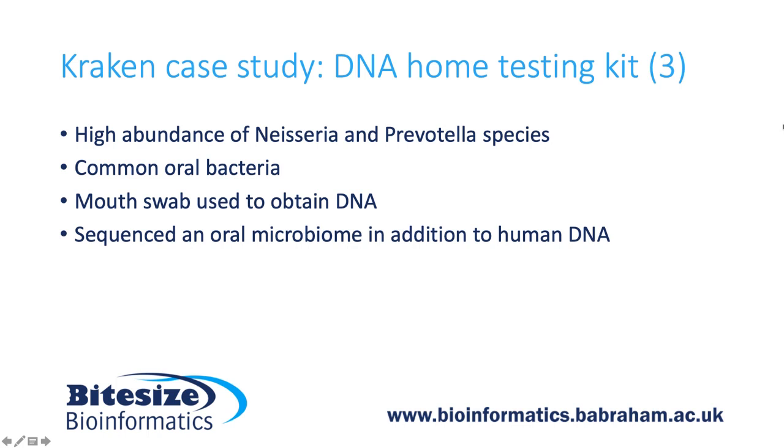So did these results we got back from Kraken make sense? Well, we believe they do. As I mentioned before, we had a large proportion of Neisseria reads, and we had a large number of reads which mapped to Prevotella species. We had a little search on these, and these are common bacteria found in the mouth. Now, what was interesting is when we looked at the protocol for obtaining the DNA from the human participants, a mouth swab was used.